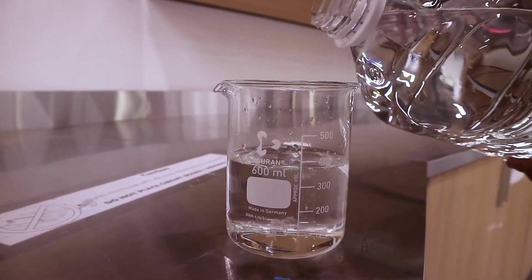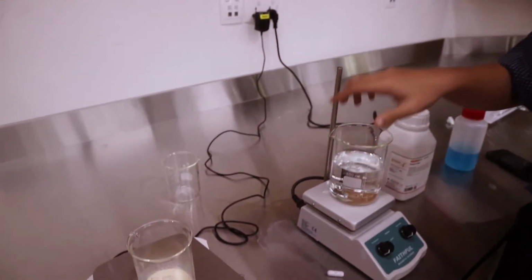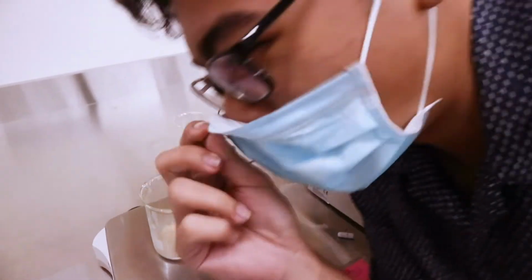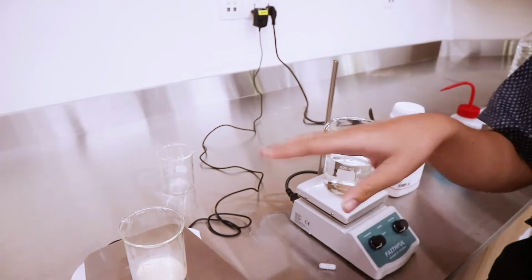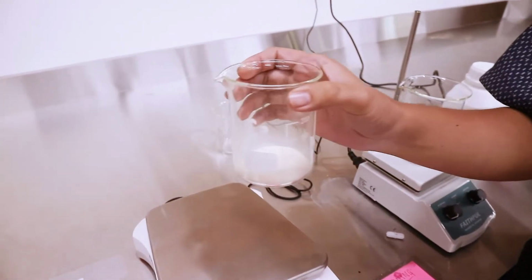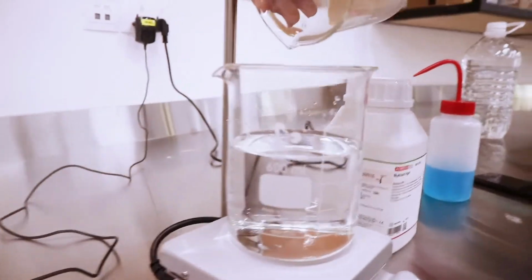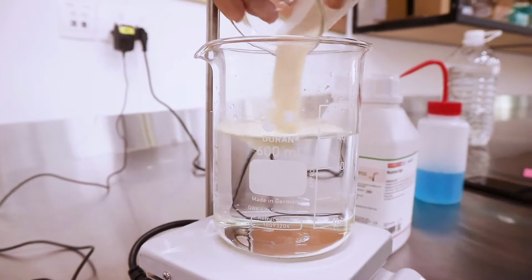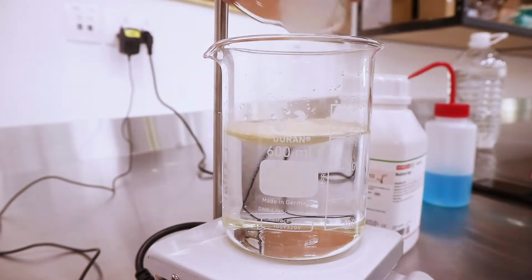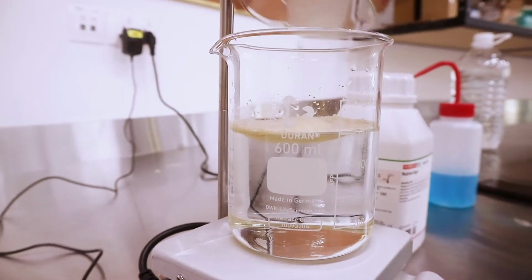Has it reached 400? The next thing you want to do is pouring the agar powder to this amount of distilled water. You may be asking why I'm wearing this mask. These things are not toxic or anything. I'm just afraid of the smell. It literally smells like shit. You just put it here. Slowly. Yeah, you can see the powder coming out of the beaker.